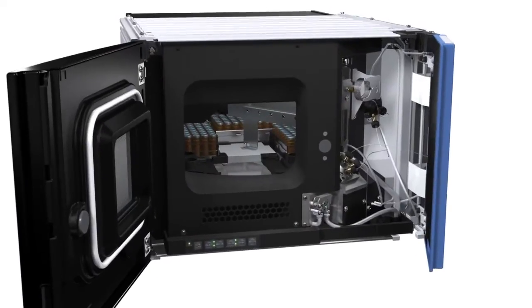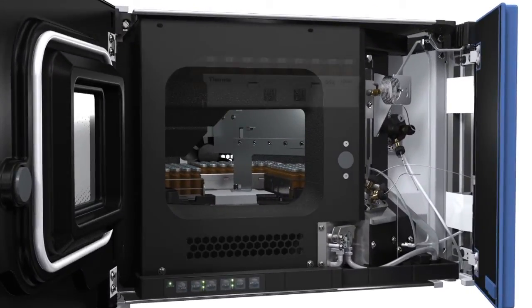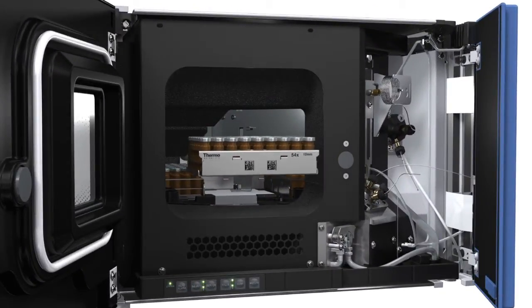Barcode reading integrated into the system and intelligent software allow for managing all these sample racks or well plates. Another thing that customers were always asking us for is extension in sample capacity. And we actually already extended the capacity of the new auto-sampler significantly, so it can hold up to 4 well plate sized sample containers right now. But you can even further extend it with a well plate feeder module that holds up to 20 additional.